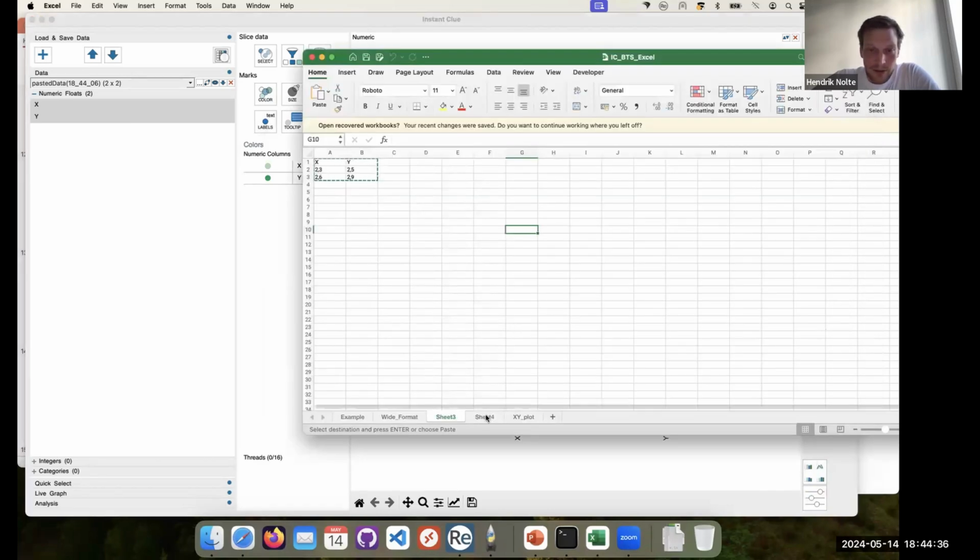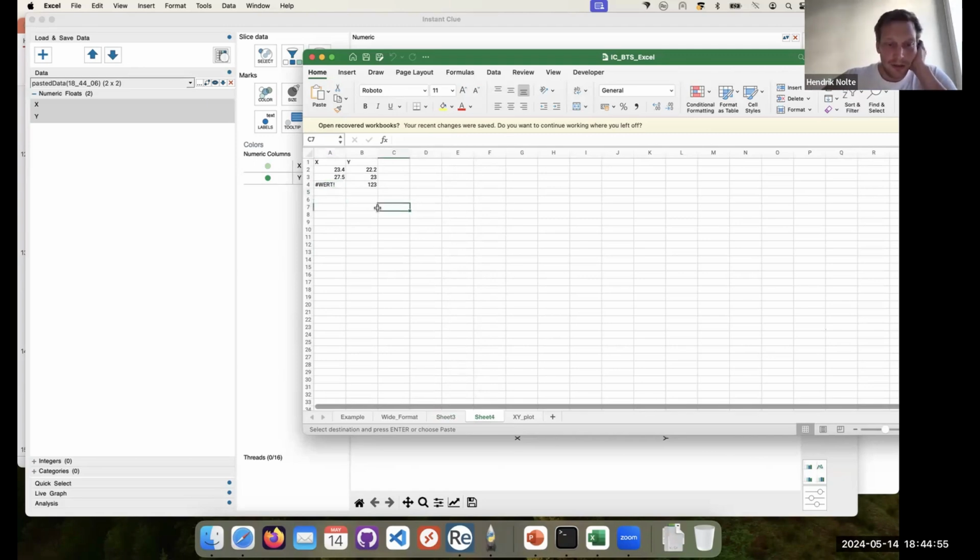Another thing is that if you're working with Excel and you are computing something, then there might be an error, which is called Wert, if it's in German, or any other type of string that Excel puts out as a warning, or divided by 0. I don't know what the error in German for that is, but there are different kinds.